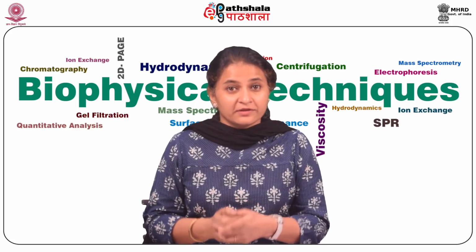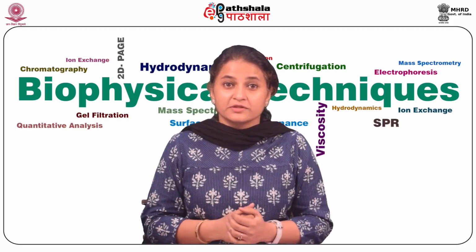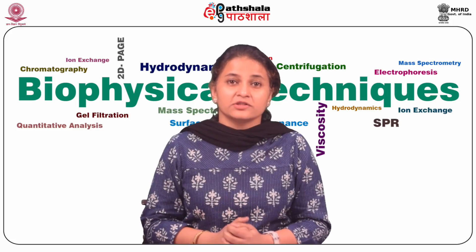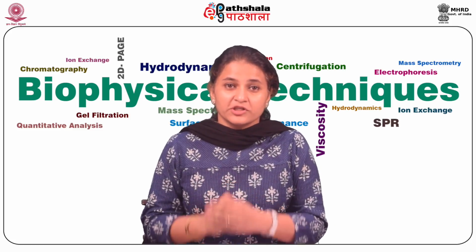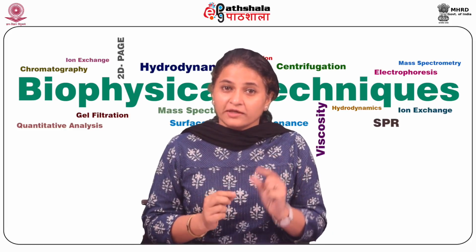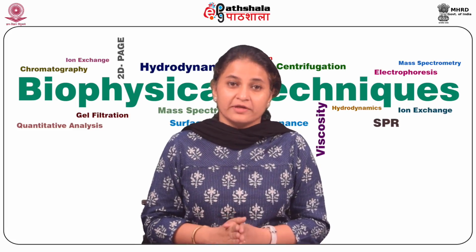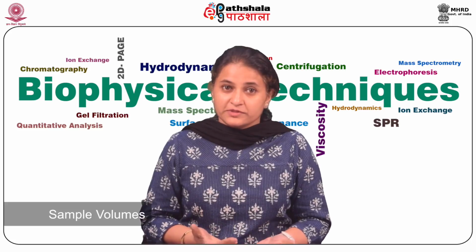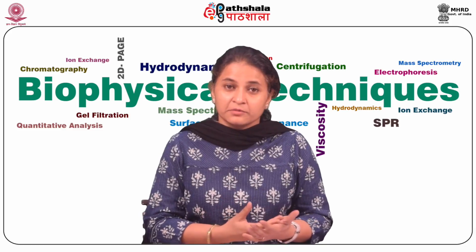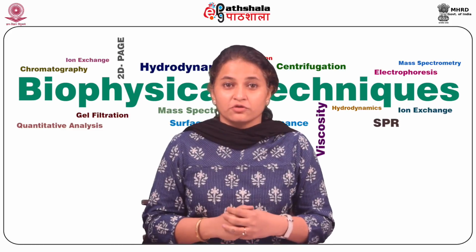Then again, the column length and diameter, which you know now range from anything between a few meters to up to 105 meters, and the diameter of the column is very critical for the GC separation process. And then the thickness of the stationary phase, which again we know can vary widely, affects GC separation in a major way. Finally, the sample volumes, and we know now that the capacity of a column is much higher when it is a packed column as compared to a capillary column in terms of the sample volume.